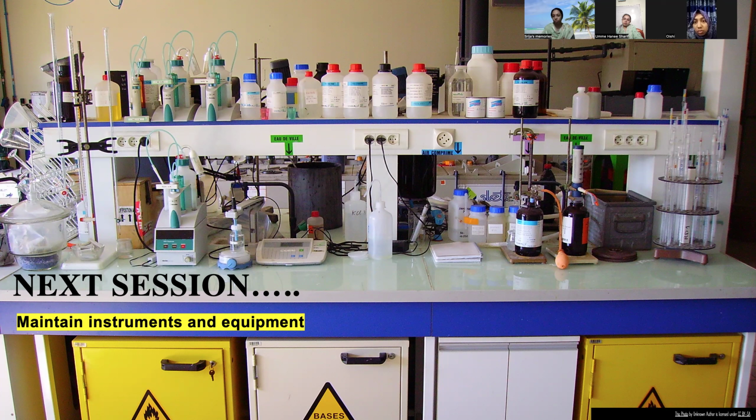If your assigned job is to work in the laboratory, not the sample collecting or transporting the sample, it's very important to maintain and organize your equipment. So our next session will be about how we maintain and handle equipment in the laboratory.